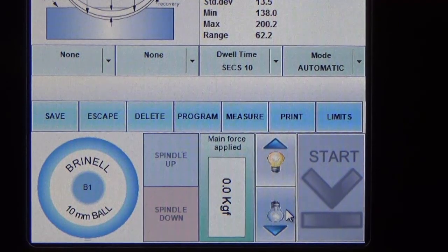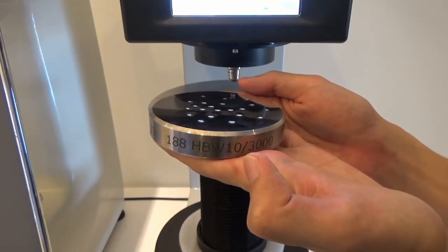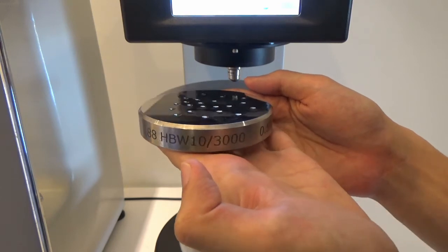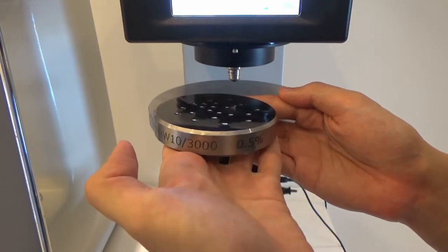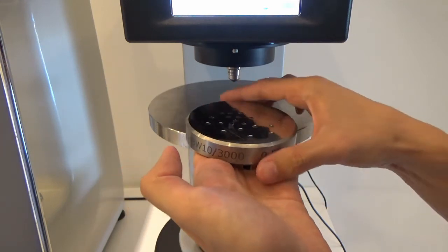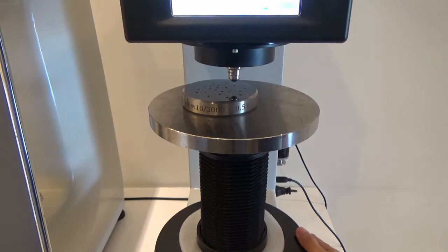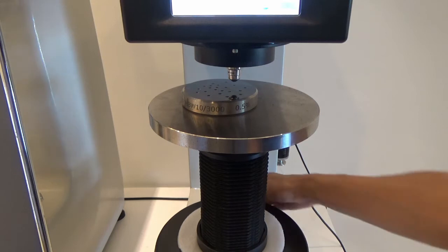Without further ado, let us proceed to do some sample testing. We are going to run a test using this test block from Innova Test, which has a Brinell hardness value of 188 and uses a 10 mm indenter as well as 3,000 kg of force, with 0.5% tolerance. First, you just need to place the test block onto the sample stage, find a clean surface, and then turn up the spindle so the sample surface touches the indenter.